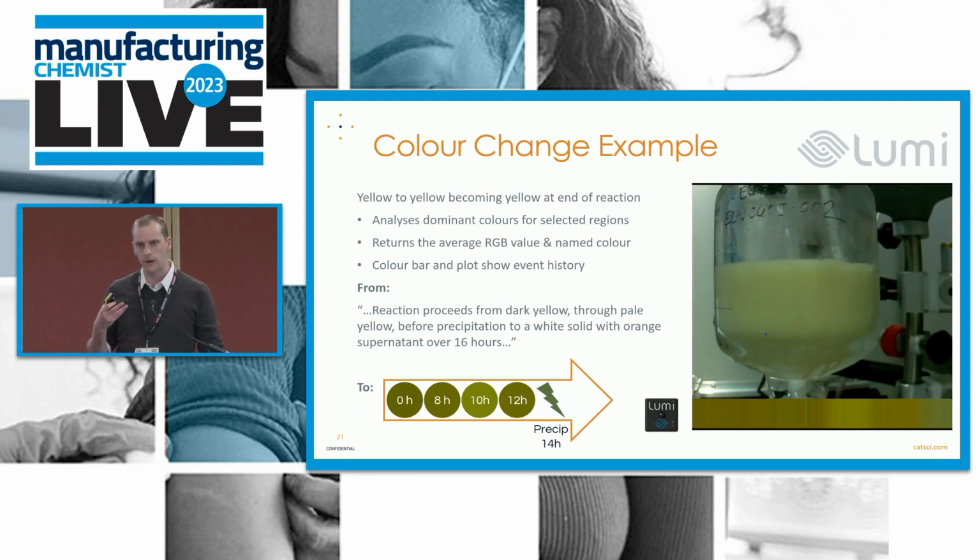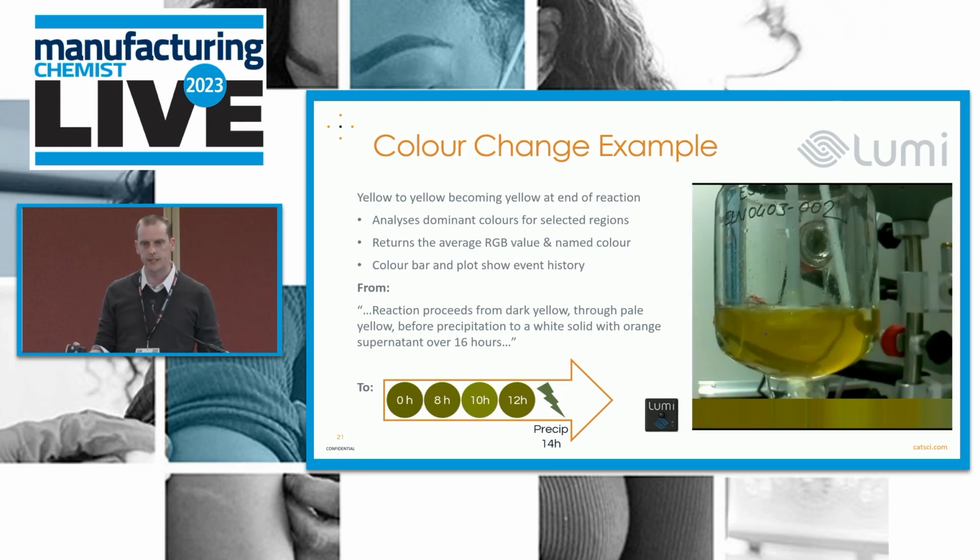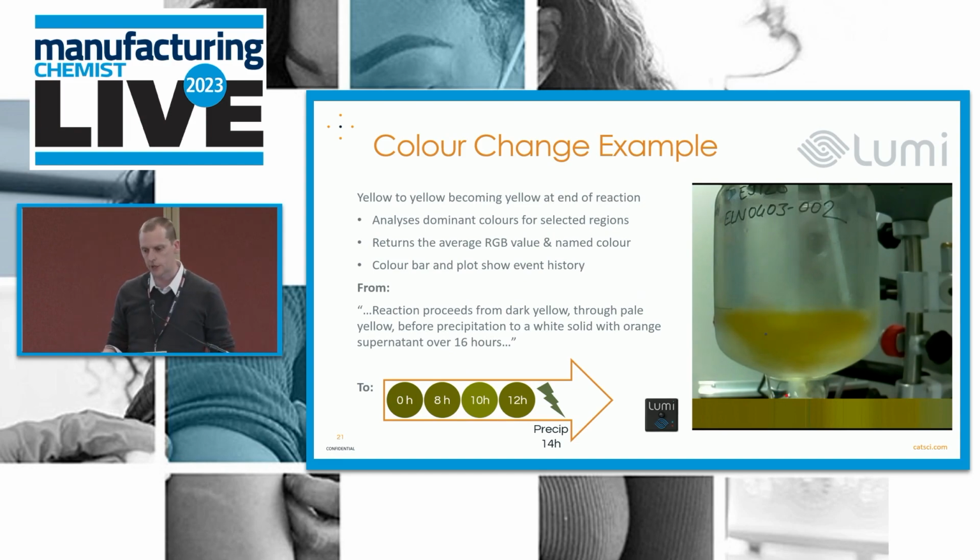So instead of writing a tech transfer document which says yellow reaction precipitated after 16 hours, you can start to say this shade of color in a hex key or something, so this shade of color over this amount of time proceeded to precipitate, and then show the images that go along with that, so that if something different happens in the scale-up, they're able to identify that quickly.